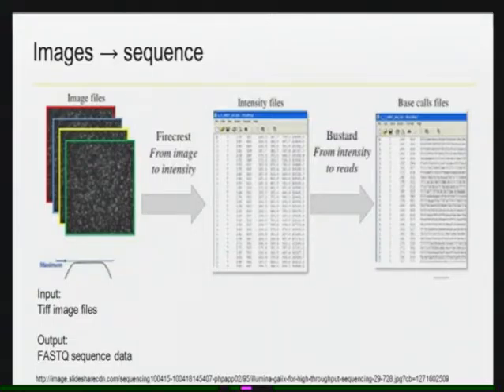Just to follow up on that question, that would seem to introduce potential batch effects between a study that was run 3 years ago and a study that was run today. Right, so that can be. If you have old data, depending on what form you have it in, you could potentially reprocess it with new software. If you only have the FASTQ, then you have to start with the FASTQ, and you would have to model the batch effect in the downstream analysis.